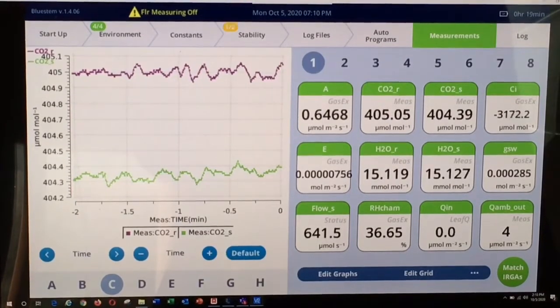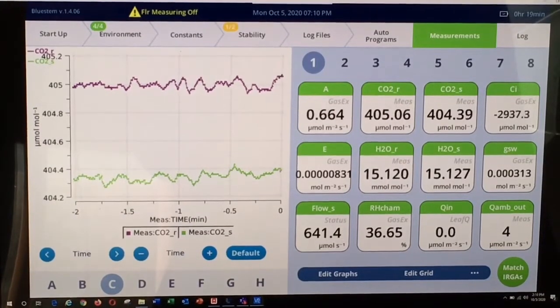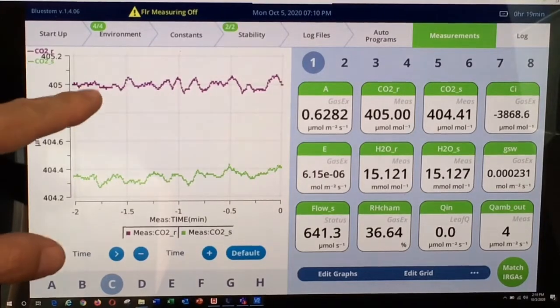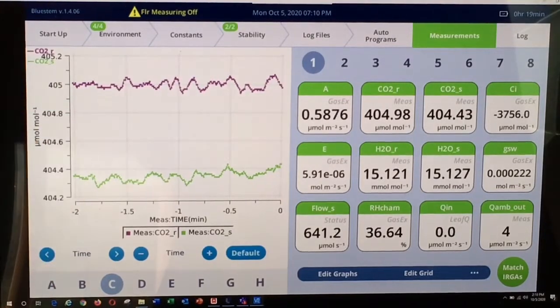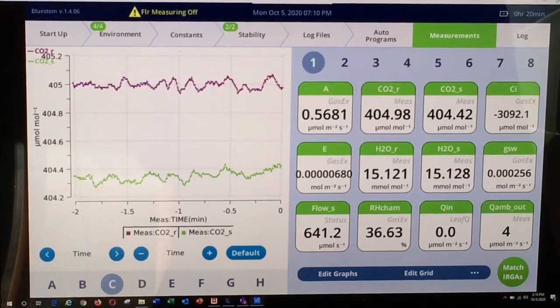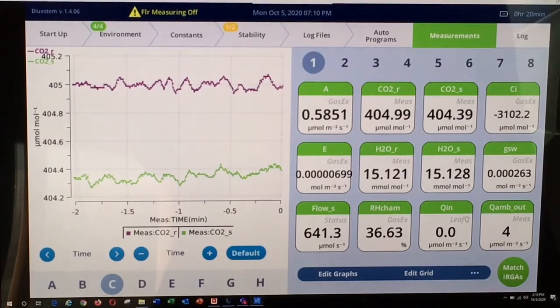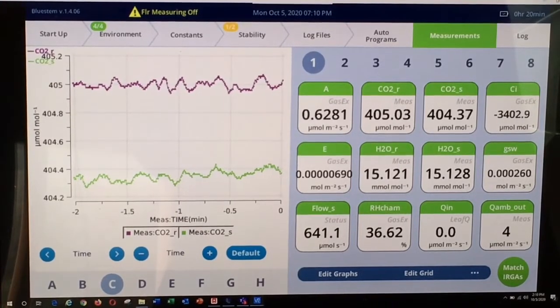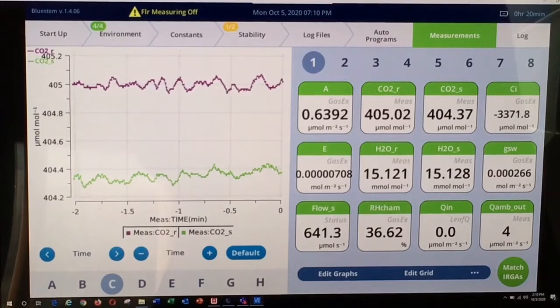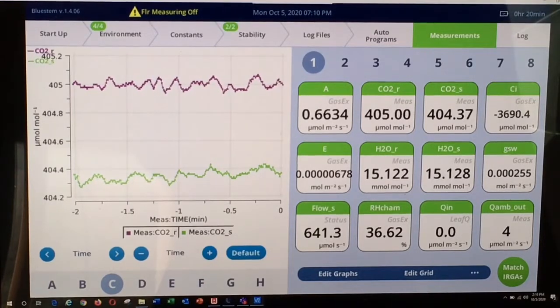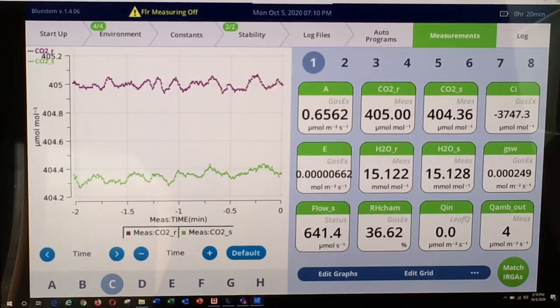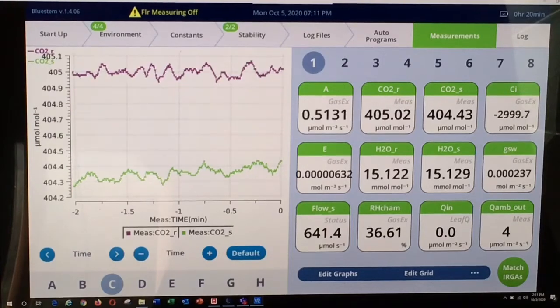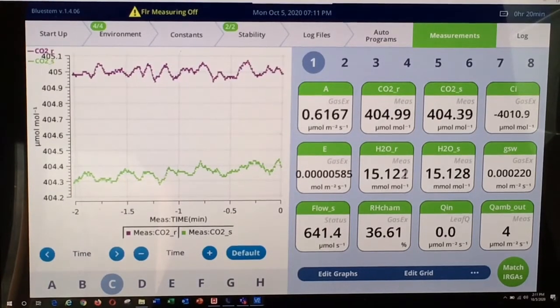As you can see on the instrument screen shown here, there is a slight offset between the reference and sample IRGA mole fractions. There are various ways to correct this. One is the traditional single point matching method. However, today I will demonstrate how this offset can be corrected using the new range match function in the LI-6800.